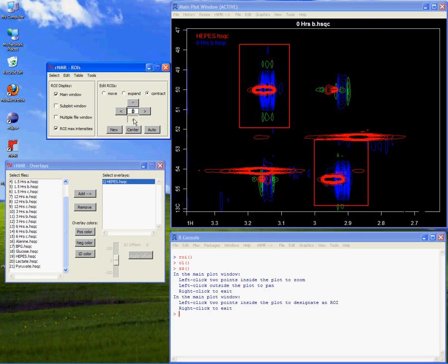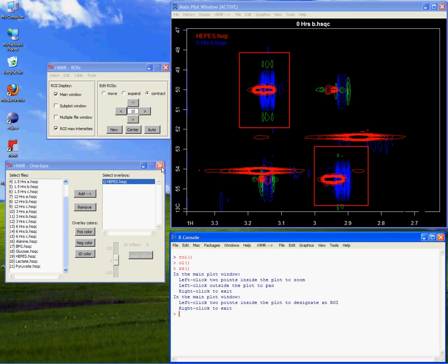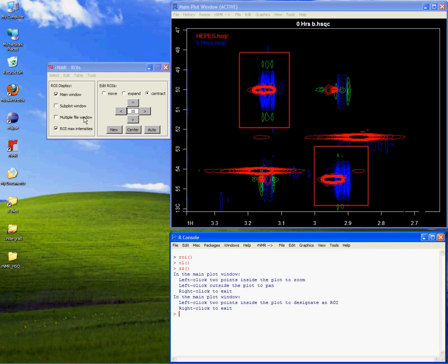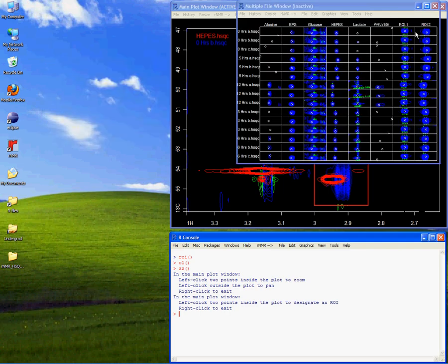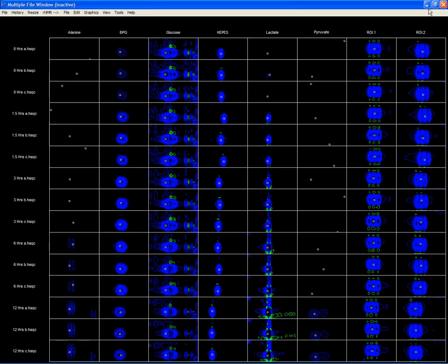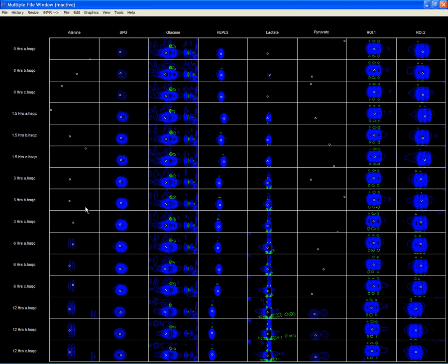Each column in this window represents a single ROI. In each row, we can see the data from the selected ROIs in each spectrum. Here we can see the alanine peaks in each of the spectra. Notice how the peaks change throughout the experiment.